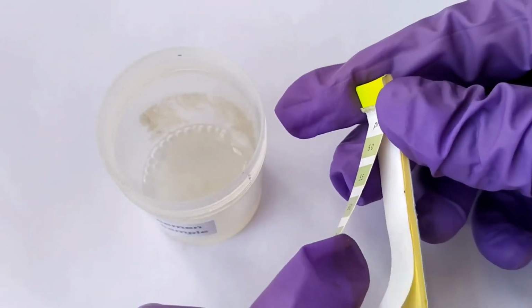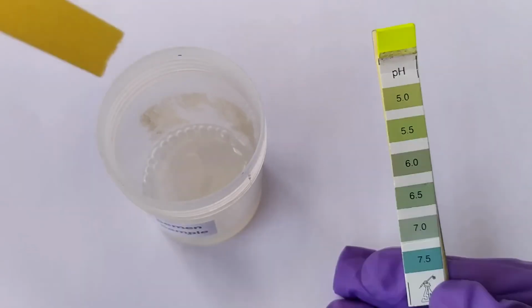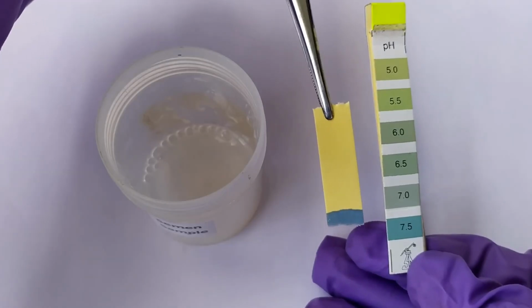Take a strip of either broad-range or narrow-range pH paper and touch one surface onto the semen sample. Observe the pH paper for color change. A more accurate laboratory pH meter can also be used to determine the pH.